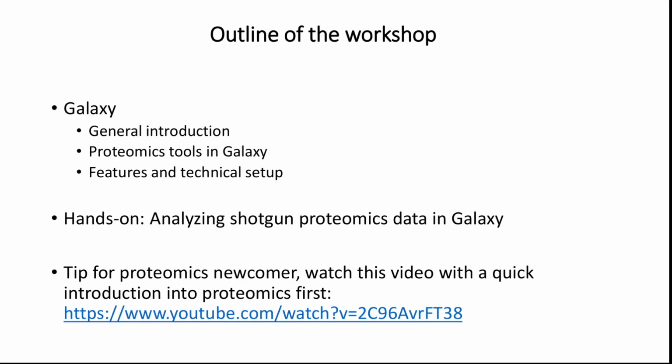Today's workshop has two major parts. First, a theoretical part with an introduction into Galaxy, its application to proteomics, and special features and technical backgrounds. The second part is the hands-on analysis of the shotgun proteomics dataset in Galaxy. That's the same dataset that was also used in the last workshop. And a tip for proteomics newcomers: I've made a video with a quick introduction into quantitative proteomics, which is available on the shown YouTube link.